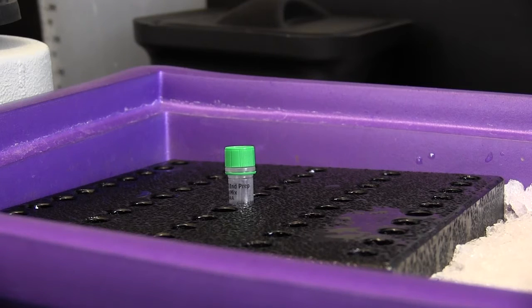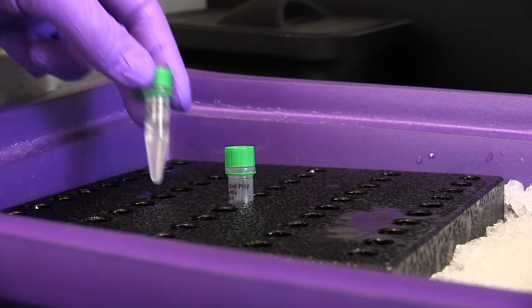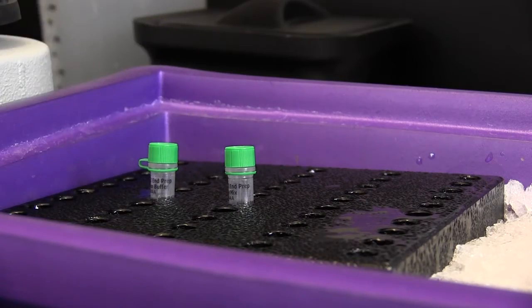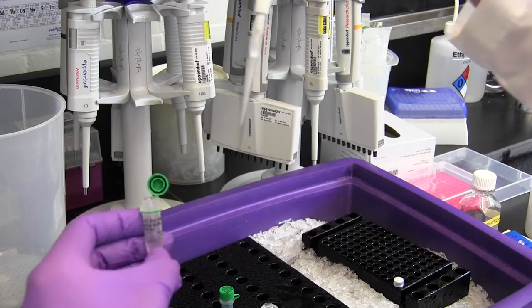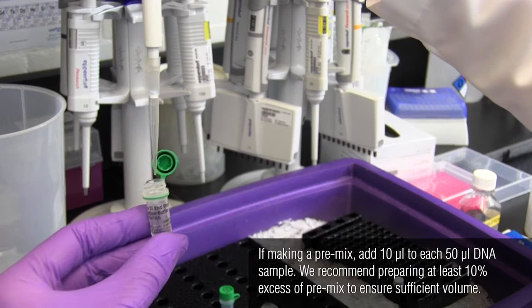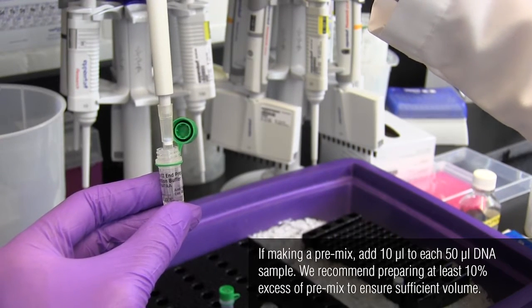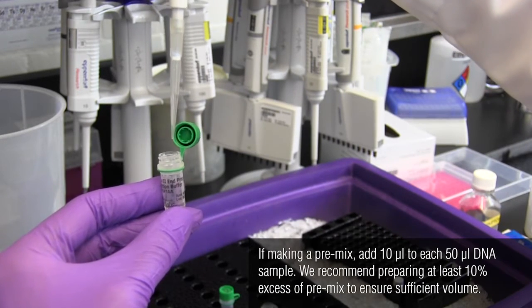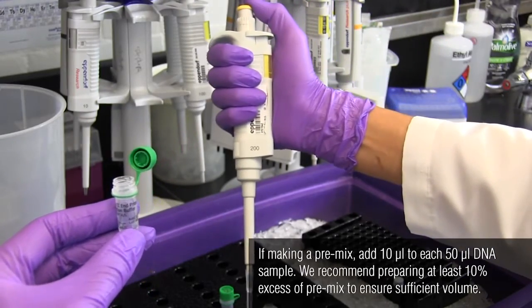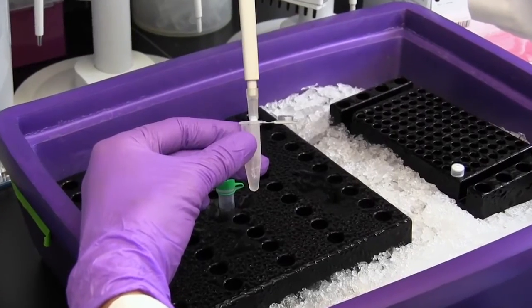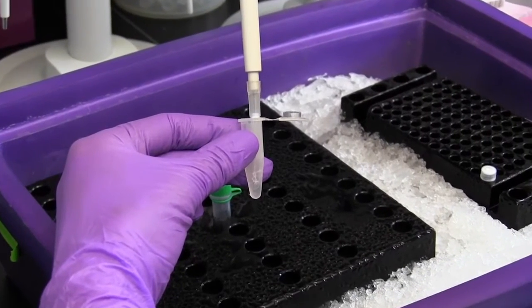You will be using the End Prep enzyme mix and the End Prep reaction buffer, which are in the green capped vials. For each library, add 3 microliters of the End Prep enzyme mix and 7 microliters of the End Prep reaction buffer to your 50 microliter fragmented DNA sample. Mix well by pipetting up and down 10 times.